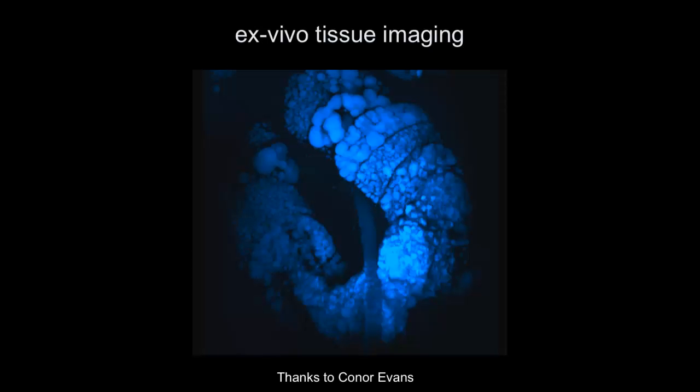Another example, this is blown up at slightly higher resolution, of the sebaceous gland. In the tissue, you see, this whole thing is one cell. Lots of blobs in there. Those blobs are individual lipid droplets. That's what this cell is doing. It's making this sebum, which is lipid, synthesizes it and squeezes it onto the hair shaft, which is the hair right here. And so this is the oily substance made by this cell that is lubricating your hair.